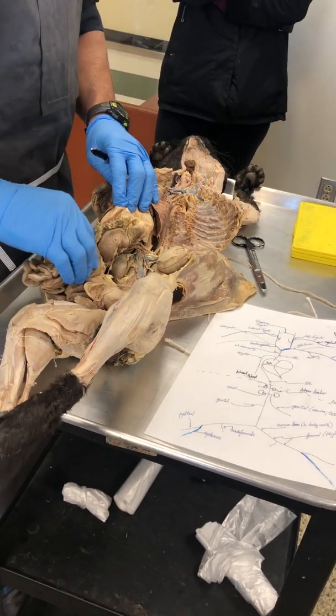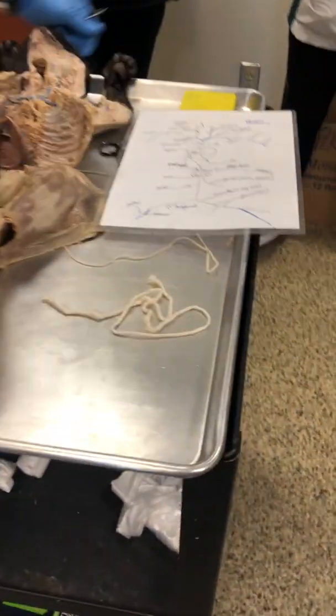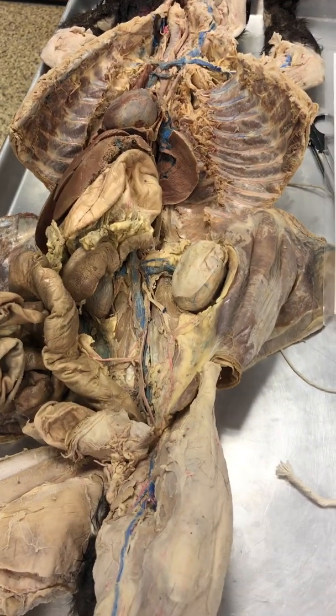Right? And now, folks, what's real neat is there is what the blood vessels look like right there. Okay? You good? Okay?